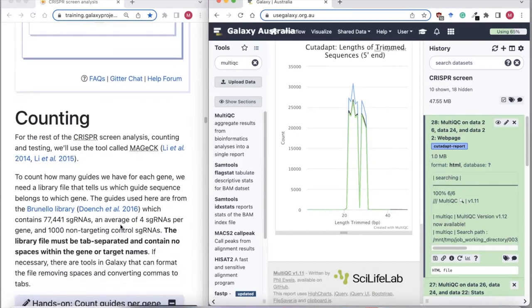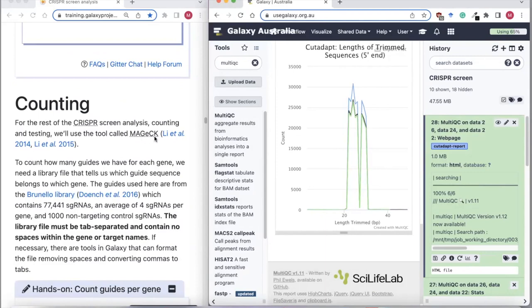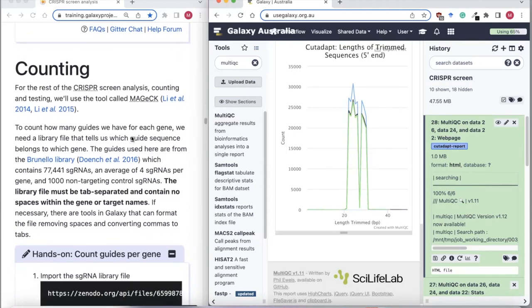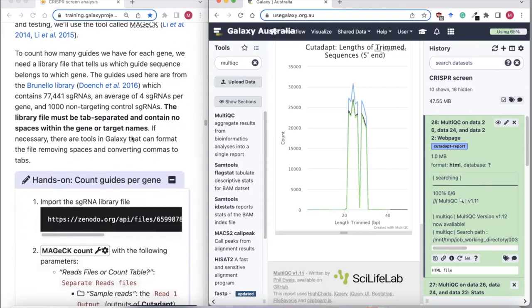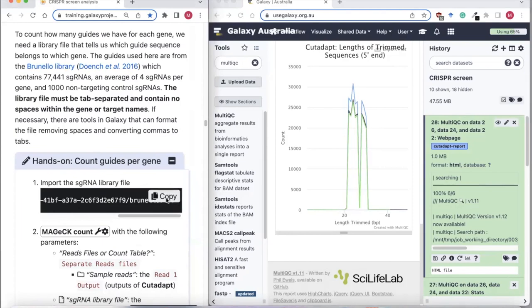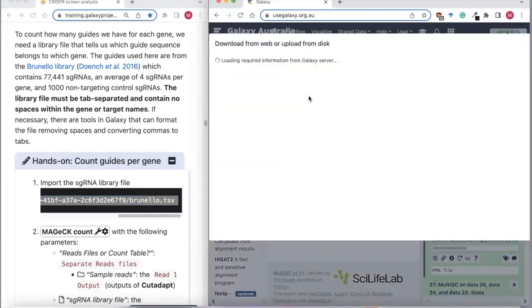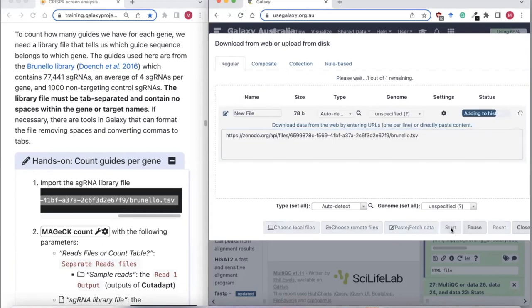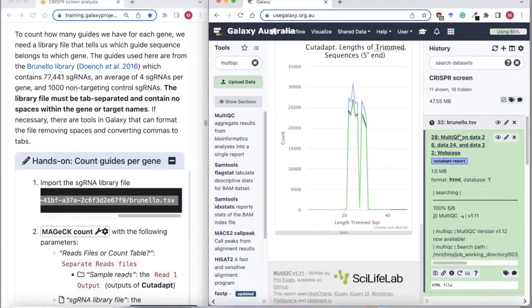Now we can go and use MAGeCK — a toolkit for CRISPR screen analysis. We will use MAGeCK count first, which will count how many reads we have for each guide. First we need to import our library file. MAGeCK count will count how many reads we have for each guide in the library file we supply. For this dataset, we're using the Brunello library, which is a human genome-wide knockout library.